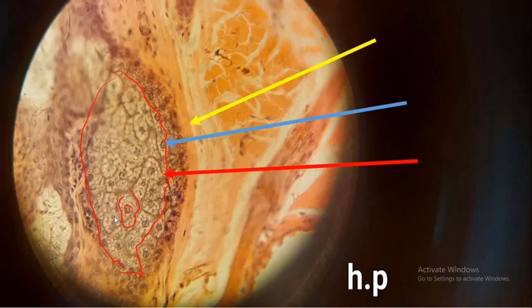So you need to draw the adjacent cells, like this cell there, that cell there, and also this cell there. You draw these adjacent cells, then you label them. You label the cytoplasm, the plasma membrane, the nucleus, and the nucleolus. Then you're done. We're talking about the cell and its organelles.